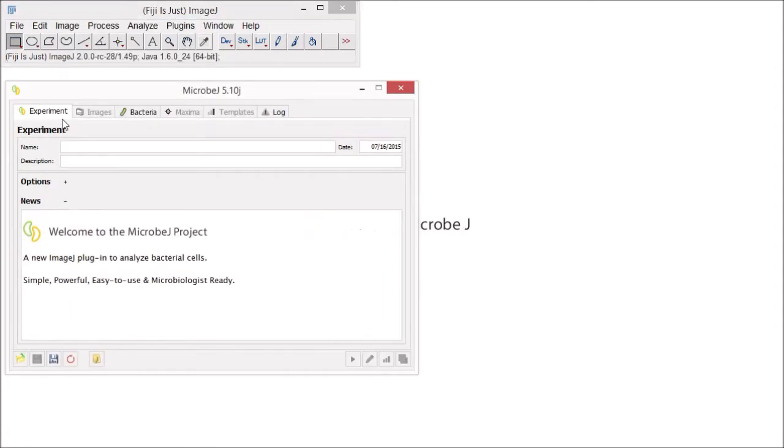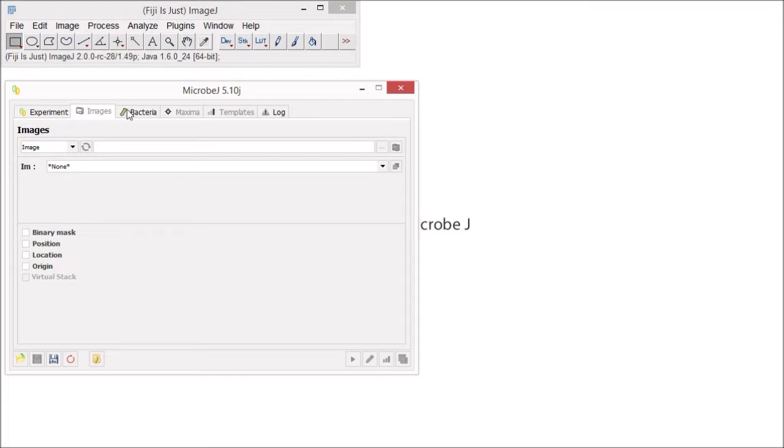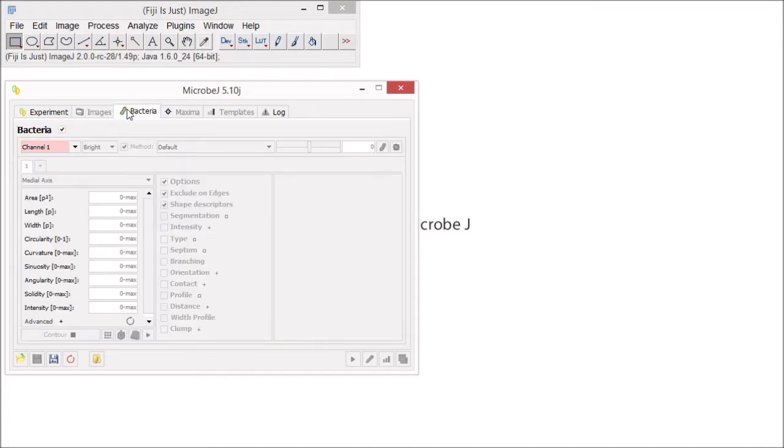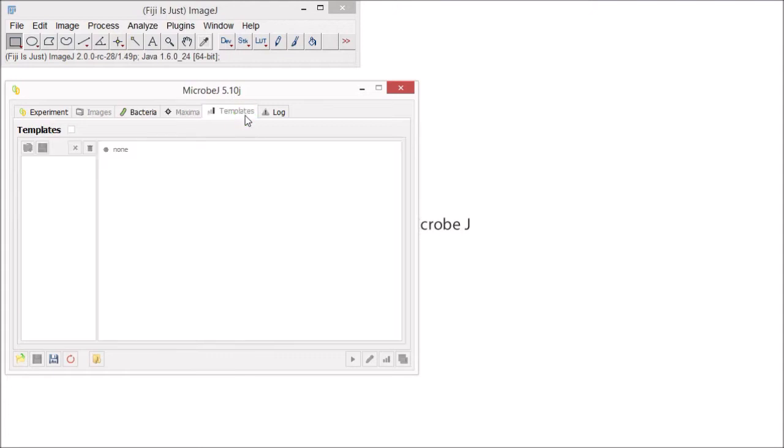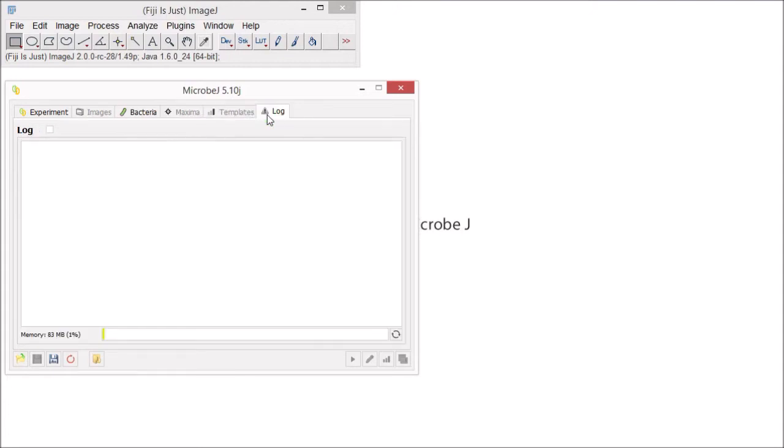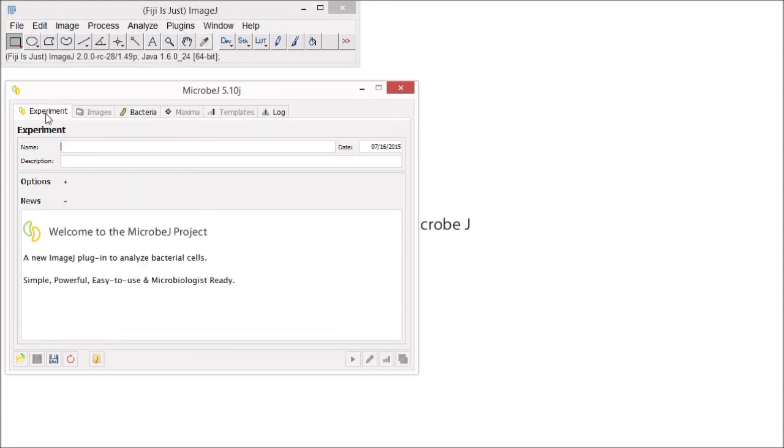To orient you to the layout of MicrobJ, first you'll notice that MicrobJ has several tabs along the top, which allow you to set up an experiment, load your image, define parameters for cell detection and analysis, detect fluorescent foci associated with bacterial cells, use templates which speed up analyzing image sets, and finally track any errors that might arise during analysis.